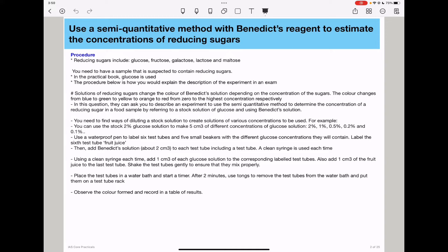In the next step, you will place them in a water bath and start a timer to allow them 2 minutes so that they can interact. You will then use tongs to remove the test tubes from the water bath and put them onto a test tube rack. Then observe the colors that are formed and record your results in a suitable table.